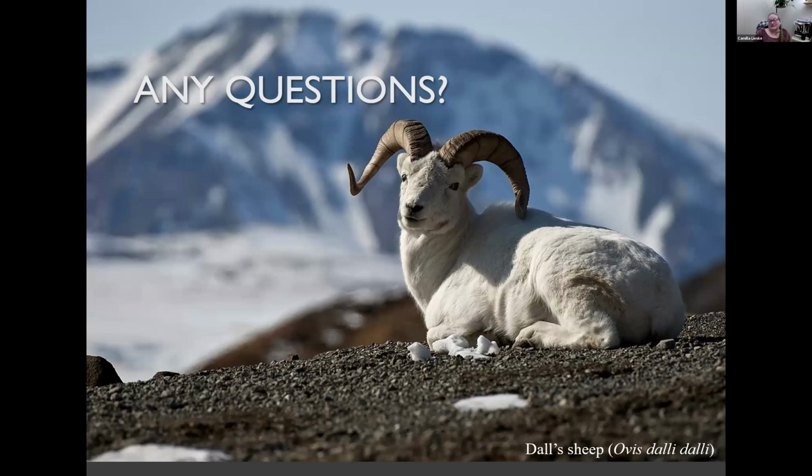But this is one of the issues. If something, say, dies in a very remote place, just trying to get personnel out there to collect the samples and bring them back can be quite a challenge. And so sometimes the condition of our sample can be very interesting. So being able to have a description and ways that we can track how poor or how good a sample is, so that we know what we can get out of it at the other end, or when an animal died, or when it was collected versus when we got it into our system, into our laboratory.